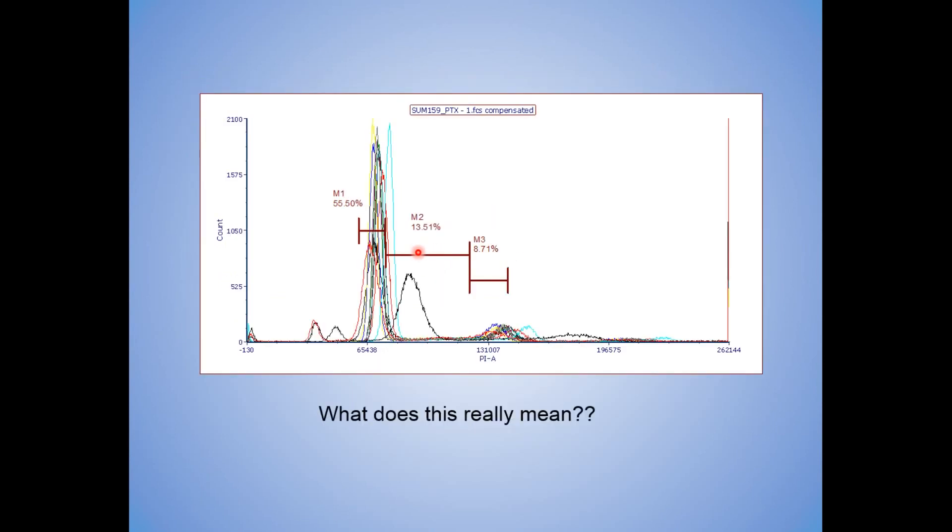So I got 12 files now all laid onto this. Now, actually, I would need to have 12 separate histograms, of course. But what does this really mean? I have three manually placed regions, 12 files. It means I have 36 regions I need to manually position and make sure they're as accurate as possible. This is where this analysis starts to break down.